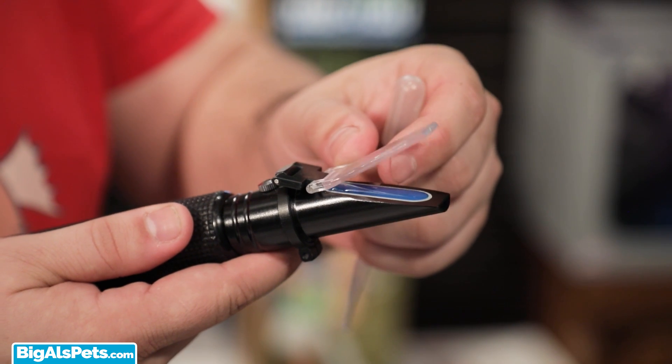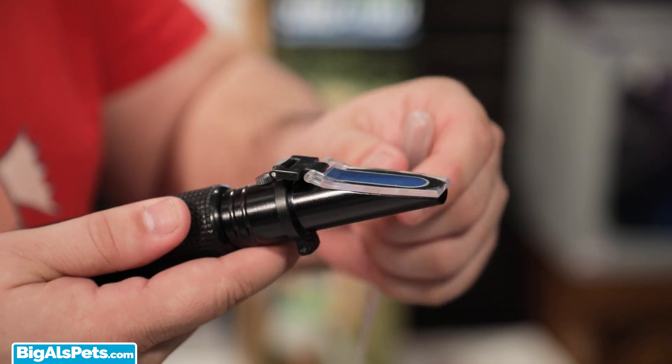It's just that easy to ensure that every reading will be an accurate reading. So, next time that you're calibrating your refractometer, just remember RO, distilled, and ultra-pure water is just not enough. So for accuracy, make sure to use Accuracy.